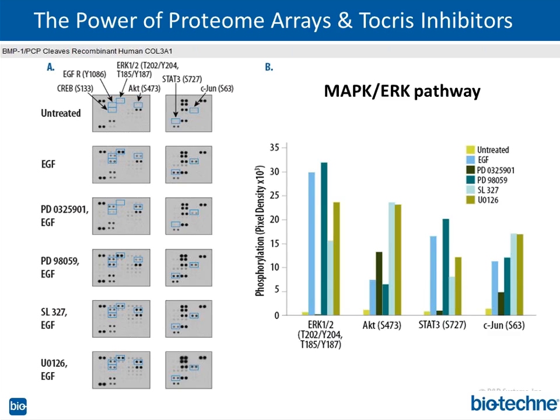You take the membrane, you grow up your cells, you treat your cells, you lyse the cells, you take the total protein, the total lysate, and you bathe the membrane in the lysate, rocking at 4 degrees overnight. You wash, you add a reporter antibody, it's HRP on the end, you add ECL, and you get chemiluminescent Western blotting data, but without a gel. Hopefully that makes sense.